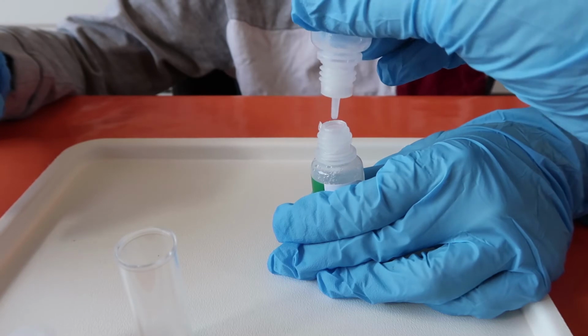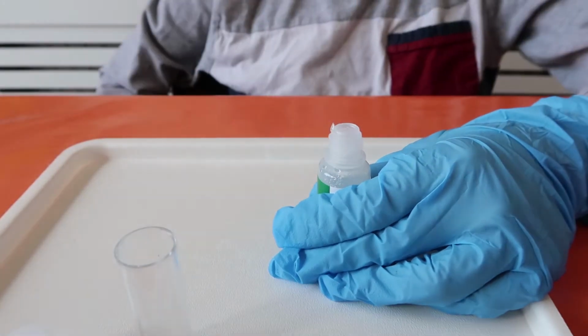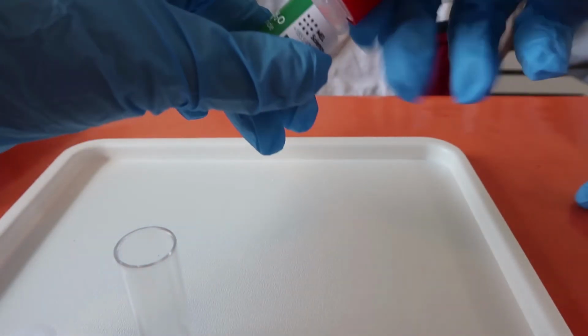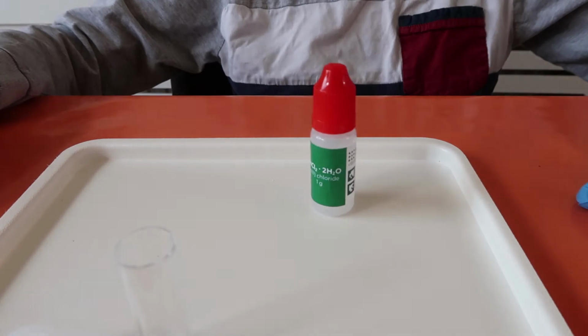Okay, I think we're nearly there, aren't we? Yep. Okay, now what we need to do is use this red stopper to pop on the top, and then when it's secure we're going to give it a shake. So can you shake that up for me? Yep.